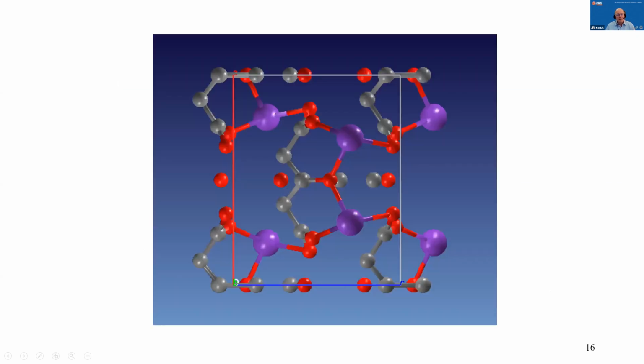So basically turn this loose in the Expo program, and after a couple of minutes, this picture shows up and we find the citrate sitting on a mirror plane. We find the potassium, that's easy because it's heavy. It actually found the lithium, which it called the carbon atom, but that's easy to fix manually. And it found the water molecule also on the mirror plane. And this took just a couple of minutes.